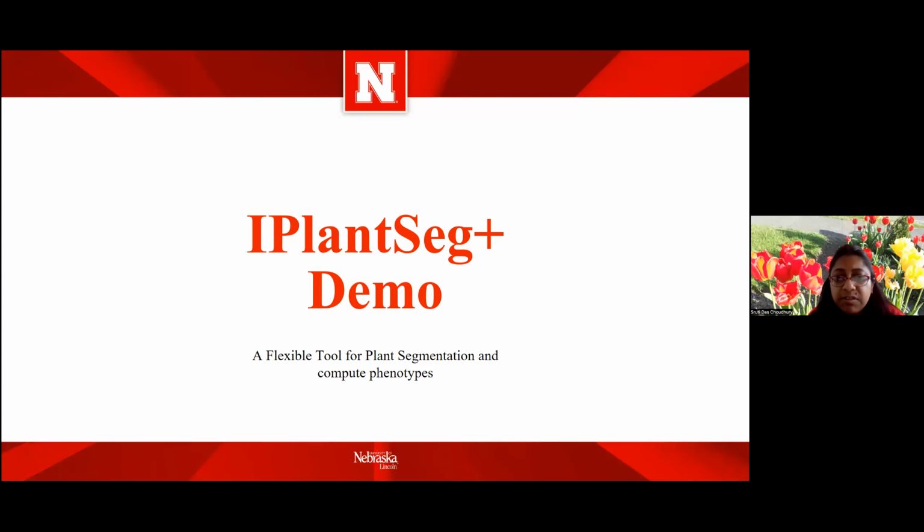Now, this is the first version of the tool that has been released. We will conduct a survey and we will encourage our workshop participants to participate in the survey to share your feedback so that we can improve our version and come up with the next more user-friendly version. So this is the initial version that we are going to demonstrate today. Thank you so much.